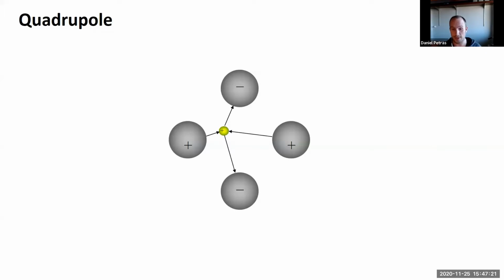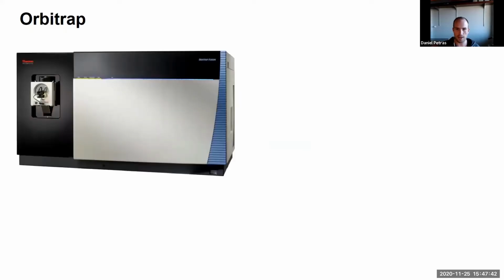The main difference here is that this is a scanning type of mass spec, where you can vary this frequency and then let different masses through. And that makes it really interesting to not do full readouts like with the TOF, but to actually set this to a given mass and use it as a filter. That's why this thing is often used as a pre-filter in hybrid mass spectrometers. So a QTOF would be one of those, a quadrupole time of flight mass spec.